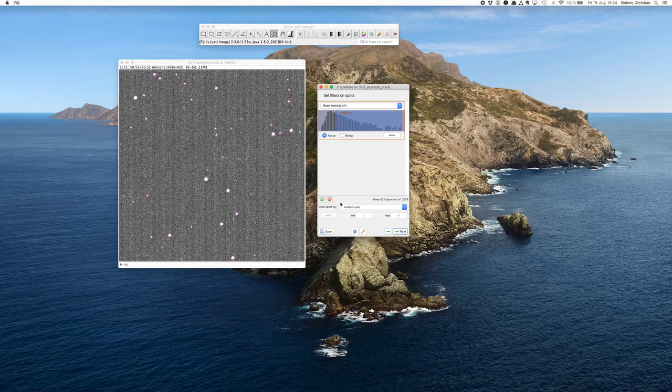You can also select other filter parameters like contrast, frame and so on, if you want to ignore a couple of frames in the beginning or at the end or something like that, whatever. I think the intensity is quite nice already now.